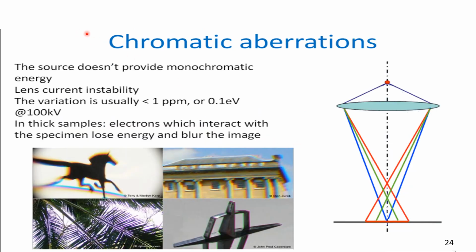Another aberration is chromatic aberration. Chromatic aberration is a color distortion that occurs when a lens can't properly focus all the wavelengths of color at the same point. Chromatic aberration appears as blurring or coloring of red, green, blue, yellow, purple around the edge of the image. It is caused basically by dispersion of the rays.